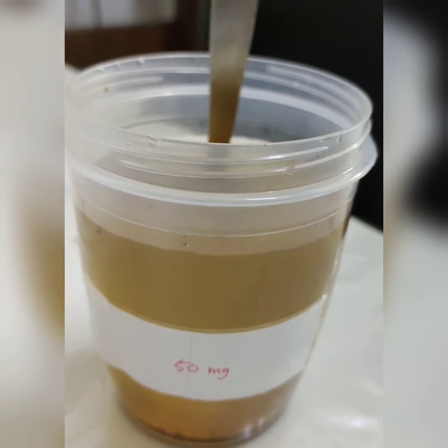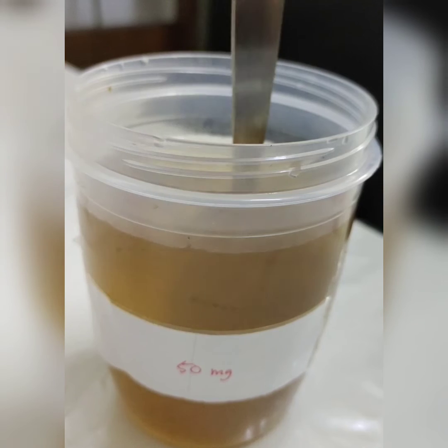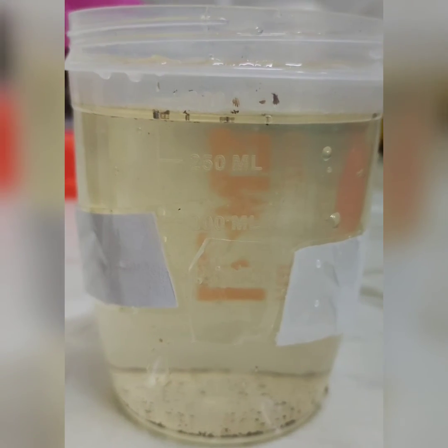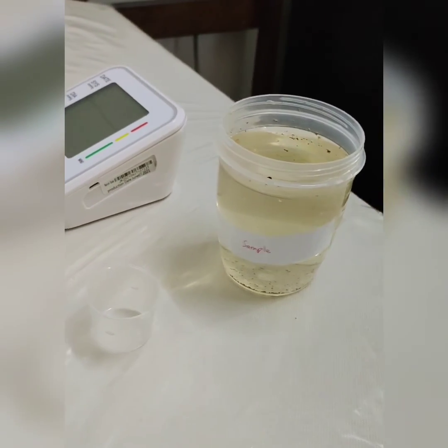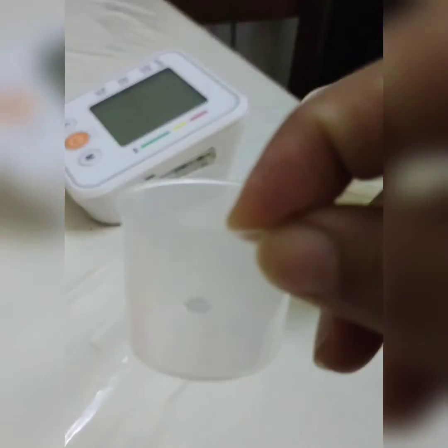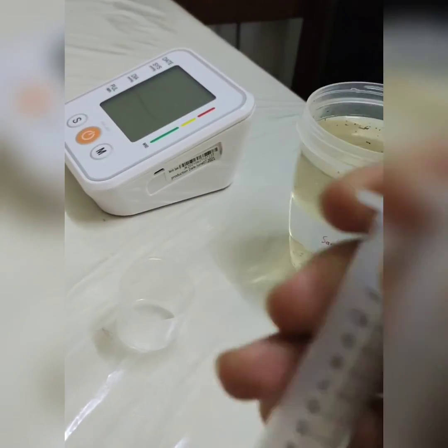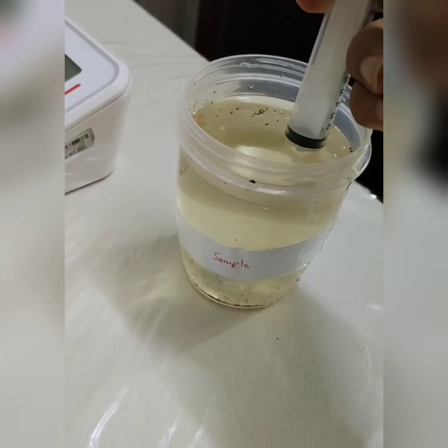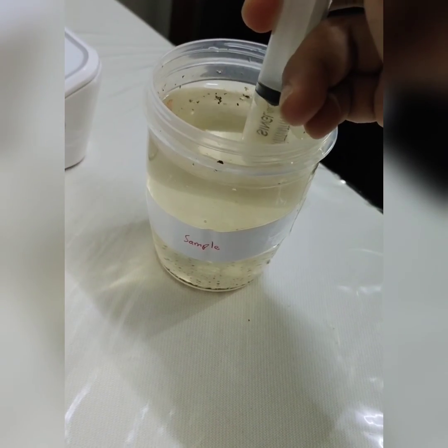And then we set the agitation speed at 40 rpm. Let it mix for 15 minutes, and meanwhile we observe the settling velocity for 10 minutes, and after that we take 25 milliliter of clear liquid, being careful not to agitate the sediment flock, and evaluate turbidity.